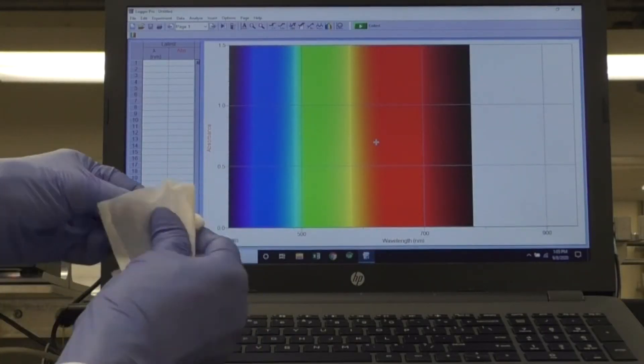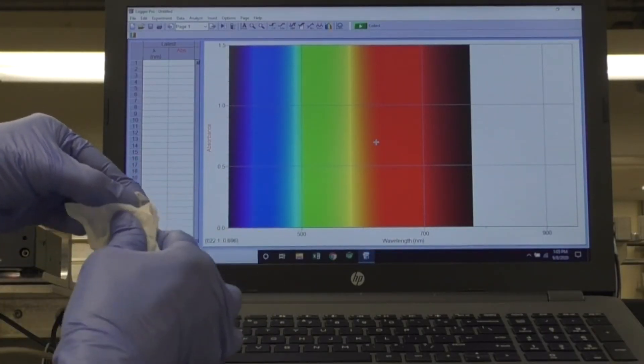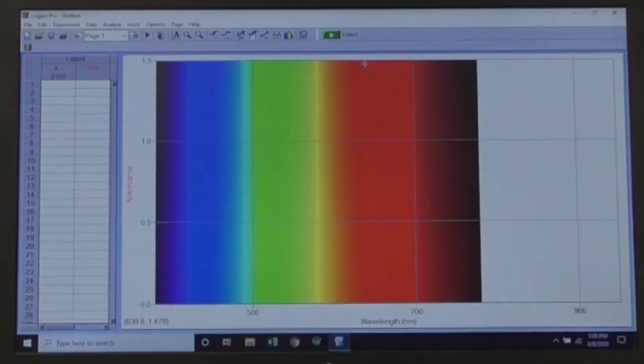When the standard has warmed for 5 minutes, remove it from the dry bath, wipe it well, place it in the spectrometer, and click Collect. Wait a few seconds and click Stop.